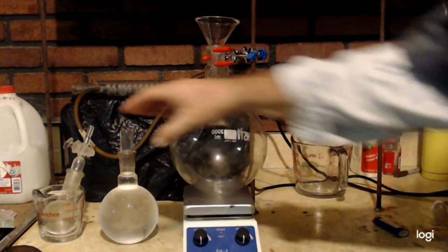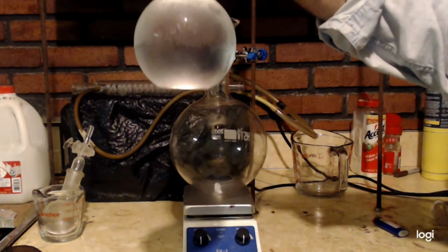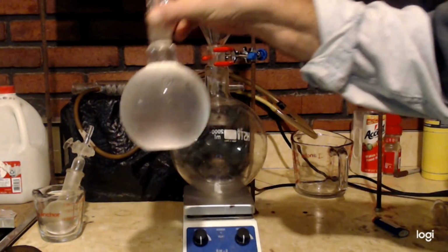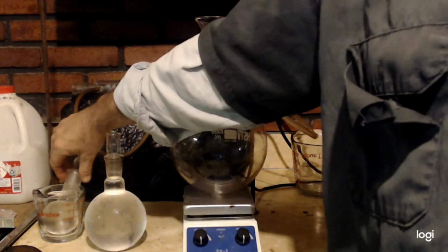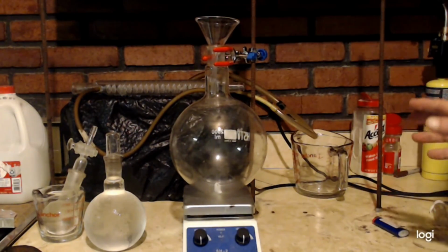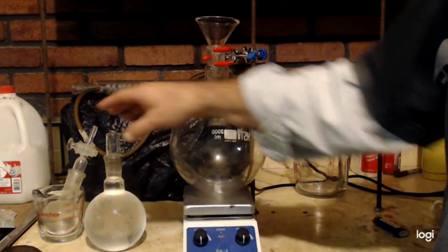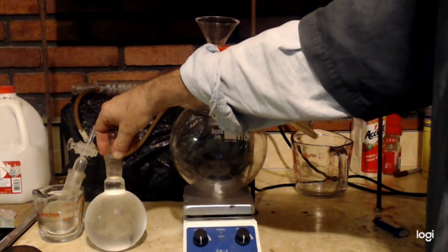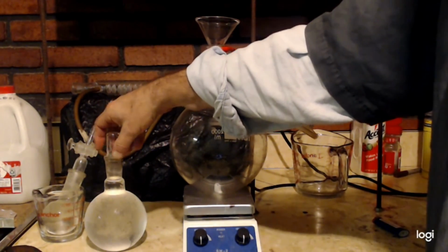Okay, so now we can just pretend that we bought some ammonia in water and it didn't have any soap in it. That's what we have basically here. I ended up getting 600 milliliters. Anyways, my point is I'm going to mix this now with the hydrochloric acid, but I put it in the freezer because I want to cool it down, since adding a base to an acid, or an acid to a base, is really exothermic.